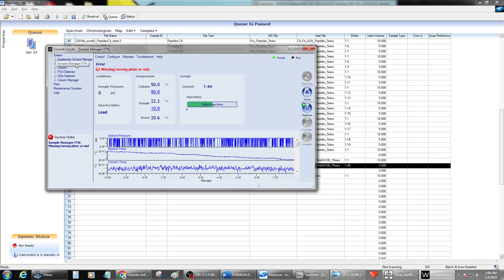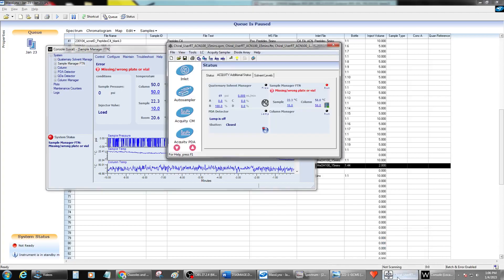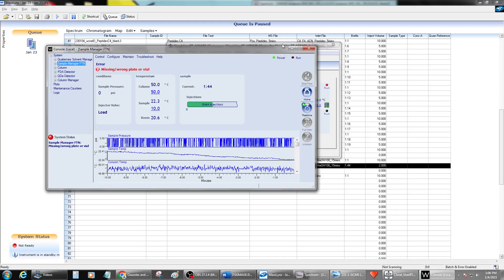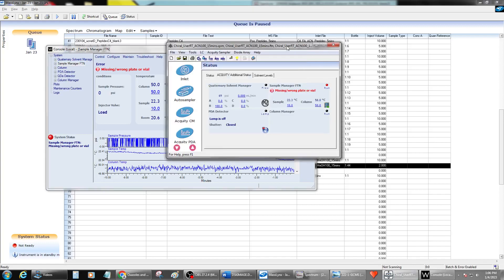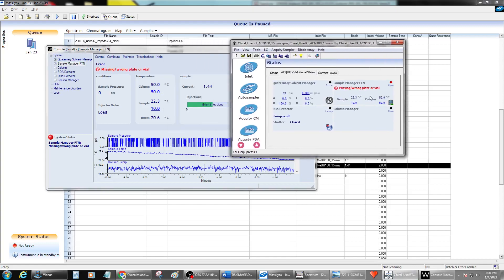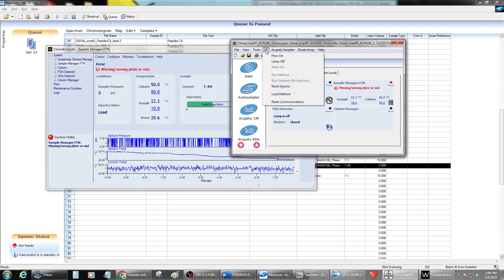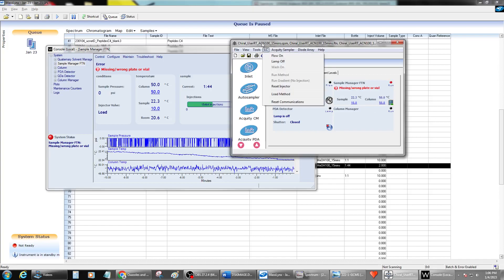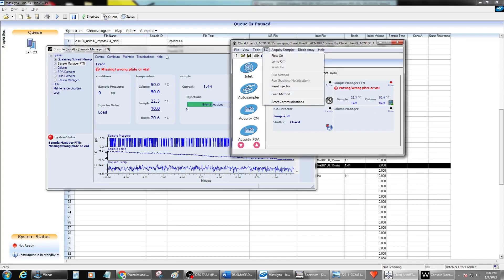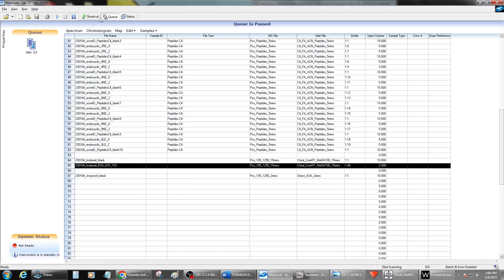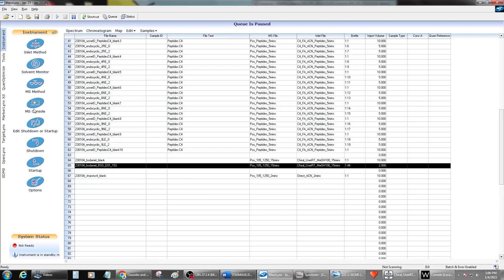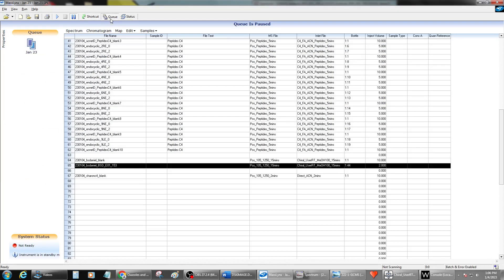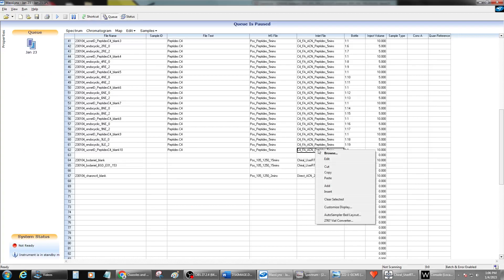So the best way to clear this error. What I like to do first, even if the instrument is running and still ready, I will reset the communications on the inlet. So the best way to get to the inlet is you can go to the shortcuts and open the inlet method or you can open the inlet method directly by right clicking on the inlet method and hitting edit.